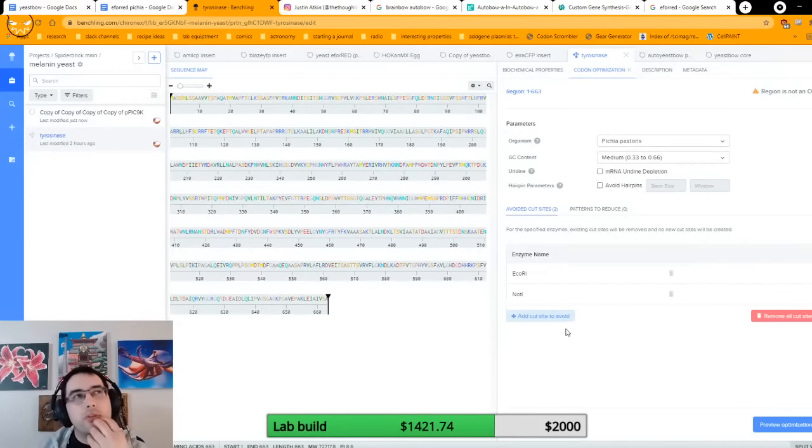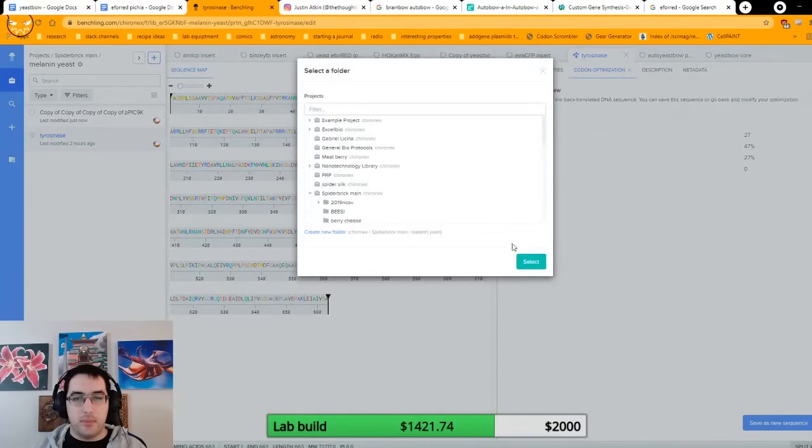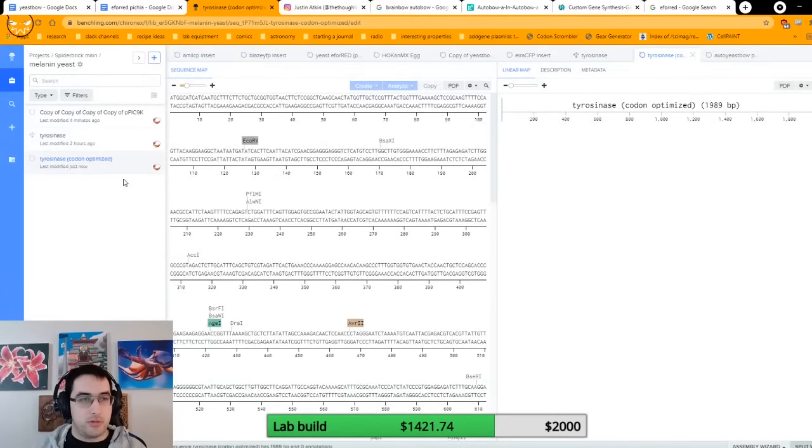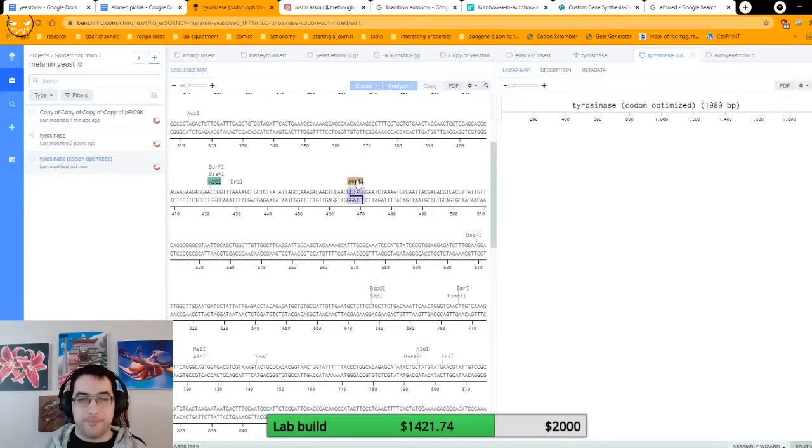Do I want to make this with a His tag? I might put a His tag on this, just for fun. That could be fun. What do I have currently that has a His tag on it that I can show on stream? I don't know, I'll sort it out. Anyway, so preview optimization. Now this is going to think for a second, load. Good GC content, good content, great, lovely. It's going to save it in the right folder, great. Oh, there's an AvrII there. Okay.